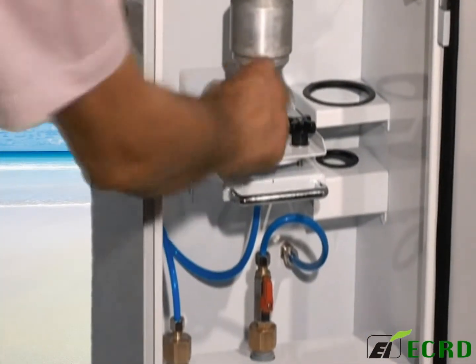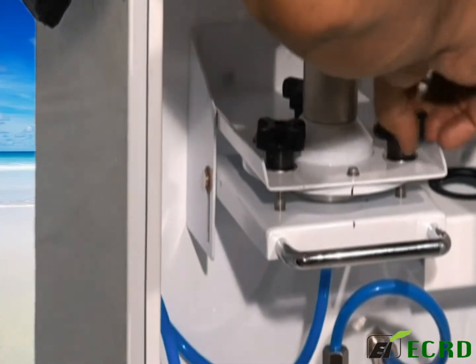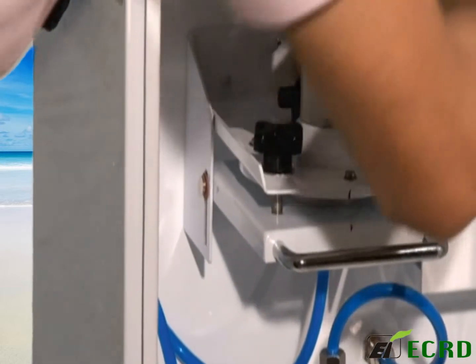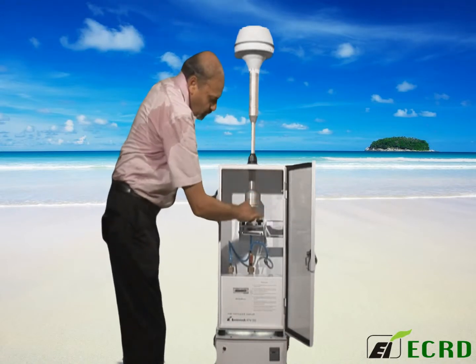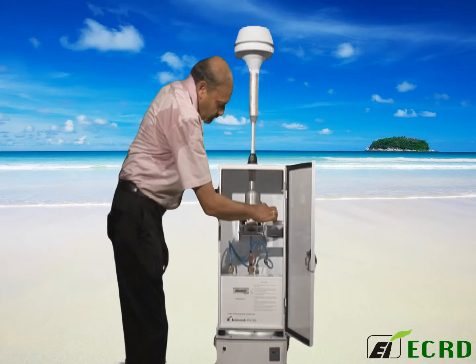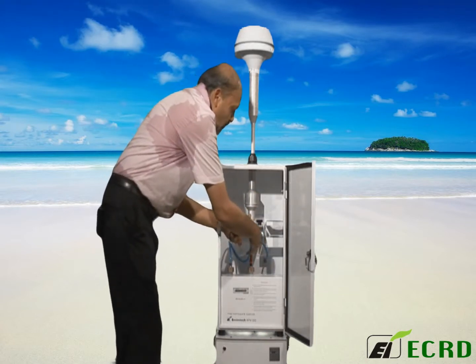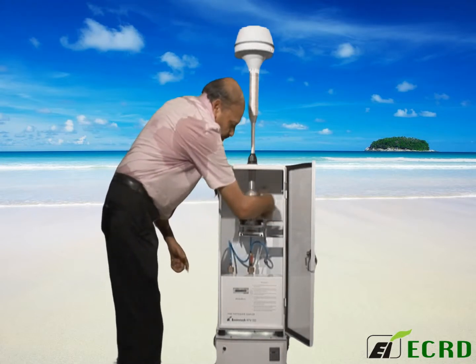You can see that I am loosening or unscrewing the nuts which are retaining the filter. Have an empty cassette holder in your hand so that you don't expose the filter holder to unnecessary dust. Gradually and carefully remove the filter holder from its holding position.